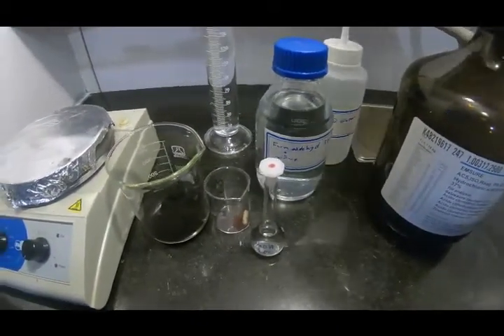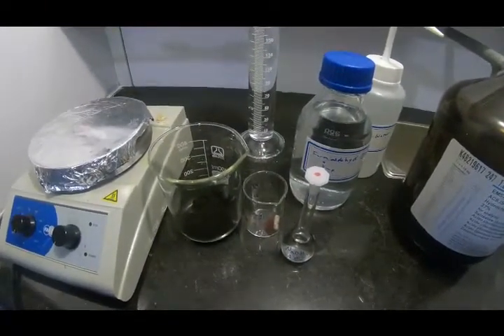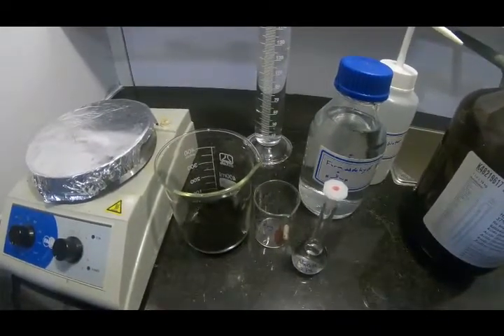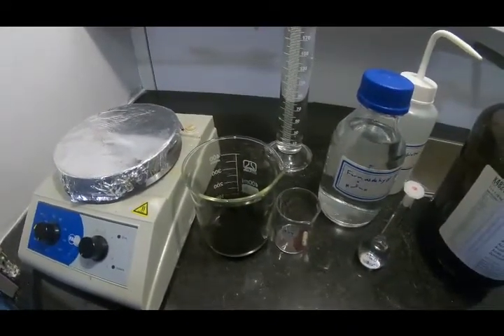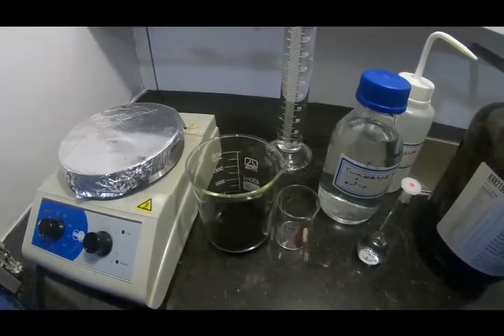First you need to heat water to around 80°C, and then you can add the palladium chloride to it and do the rest of it. So first we are going to heat some water.